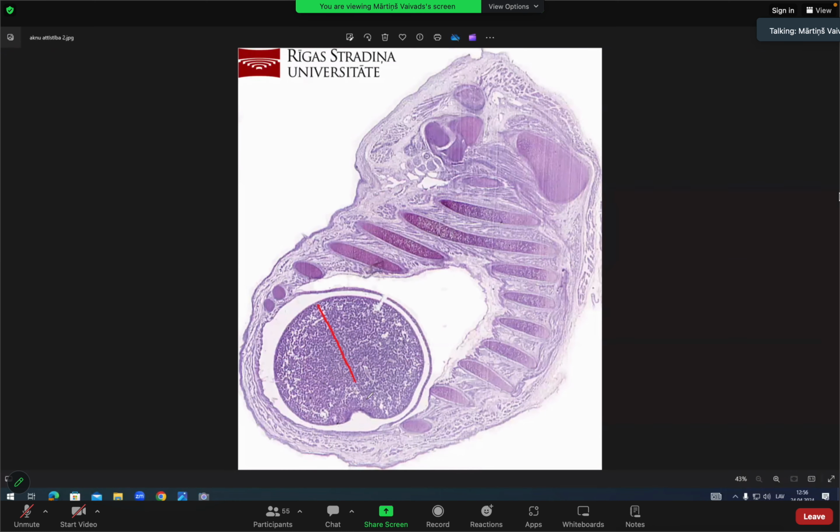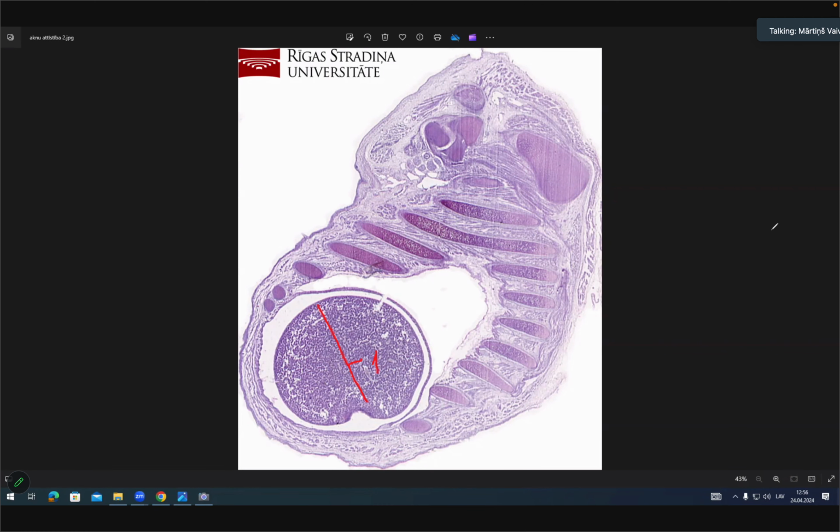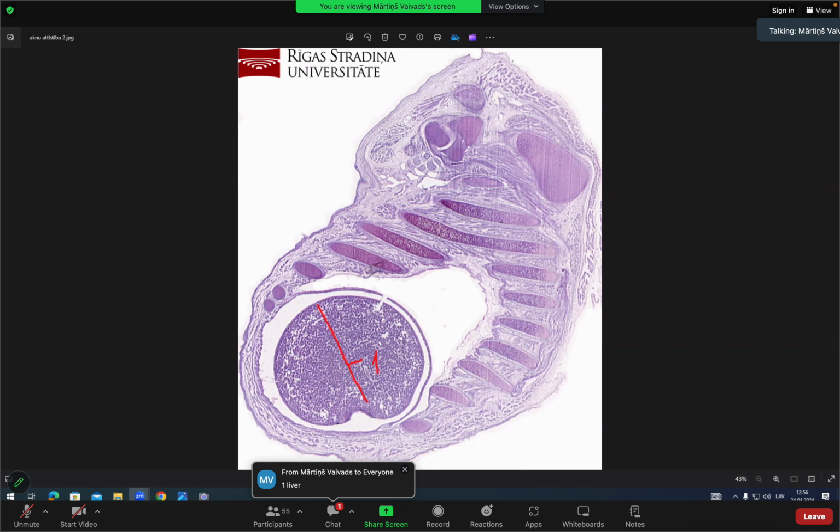First of all, here, this is liver. So number one, developing liver. So liver development. As simple as that, we see the liver. We cannot distinguish the cells, because we need very high magnification. Who knows in which cavity the liver sits in? Abdominal cavity, good. Abdominal cavity.